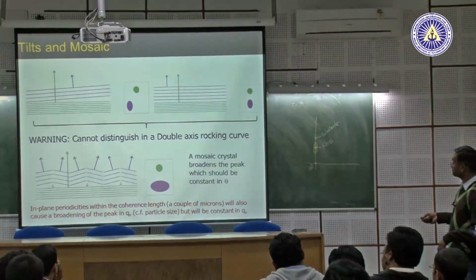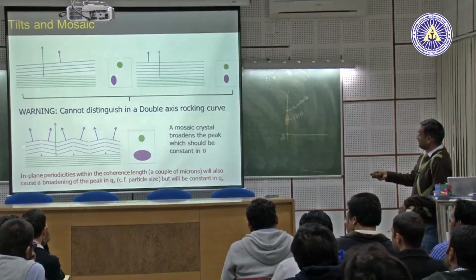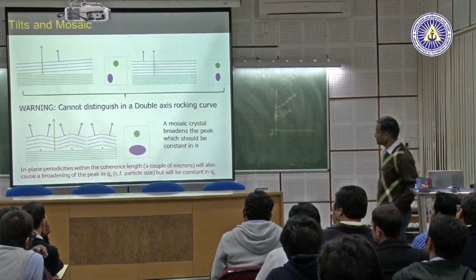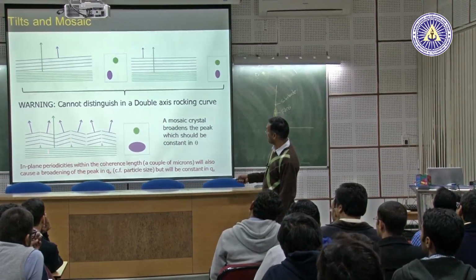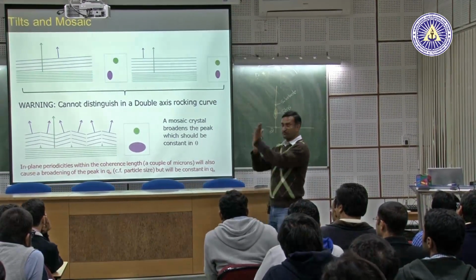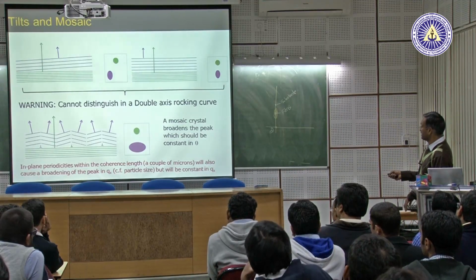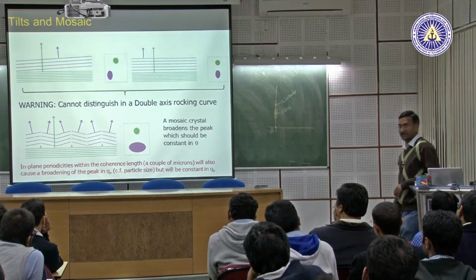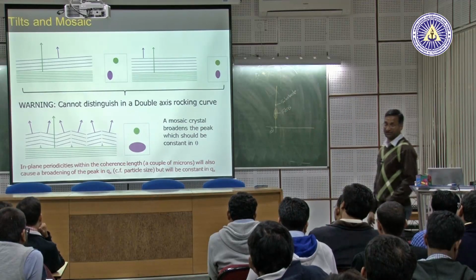And if you have this kind of misalignment, where you have multiple misalignments, let us say a mosaic texture, where your perpendicular vector has a little bit of randomness associated with it, in that case it also leads to changes within the q vector as well. So, not only do you have a smear in this direction, but also a smear in the other direction.